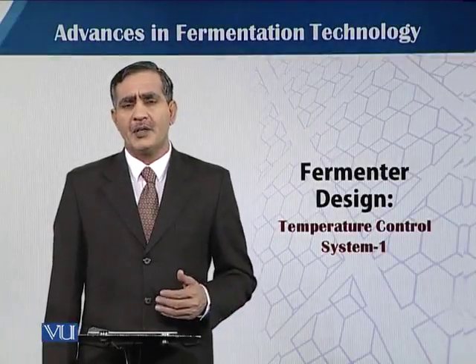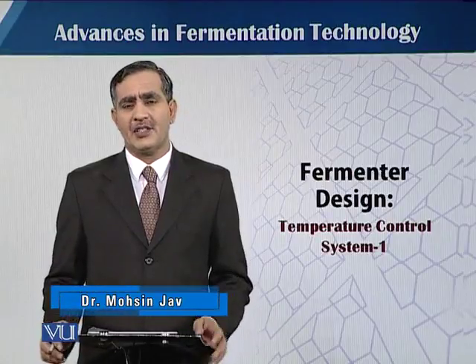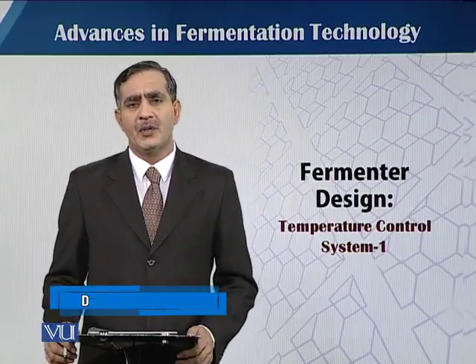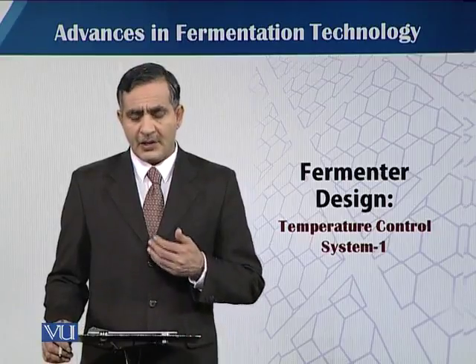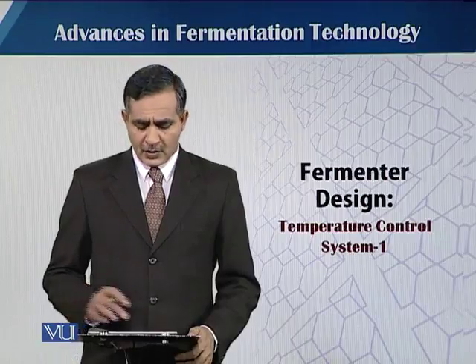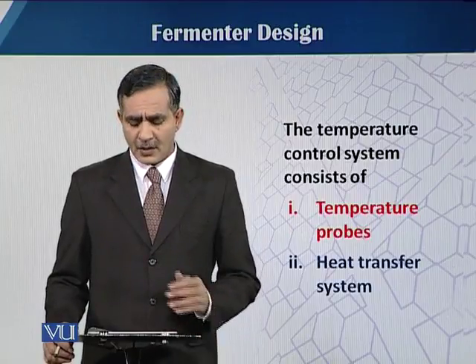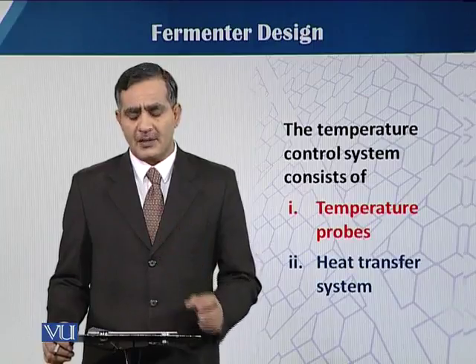In our previous module, we discussed the agitation system in fermentation design. But in this module and later modules, we will discuss the temperature control system. The temperature control system consists of two major parts.